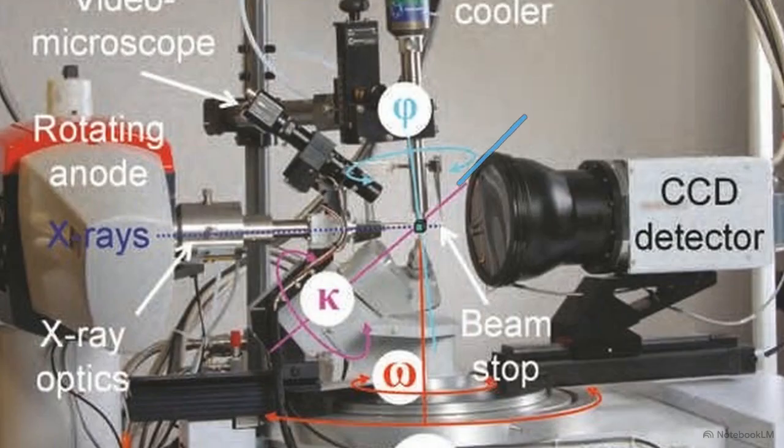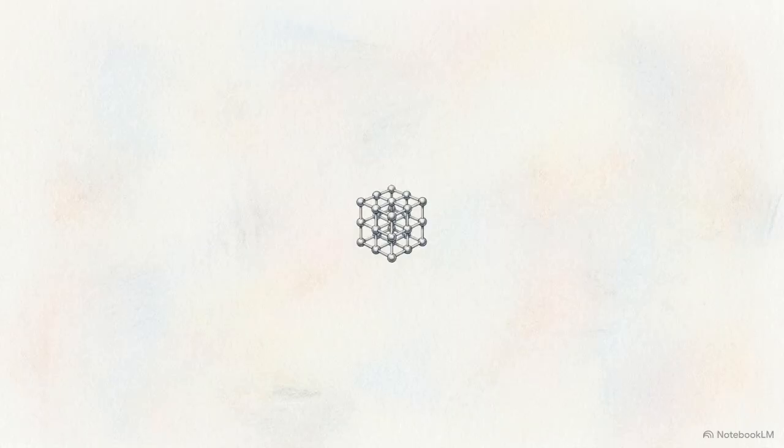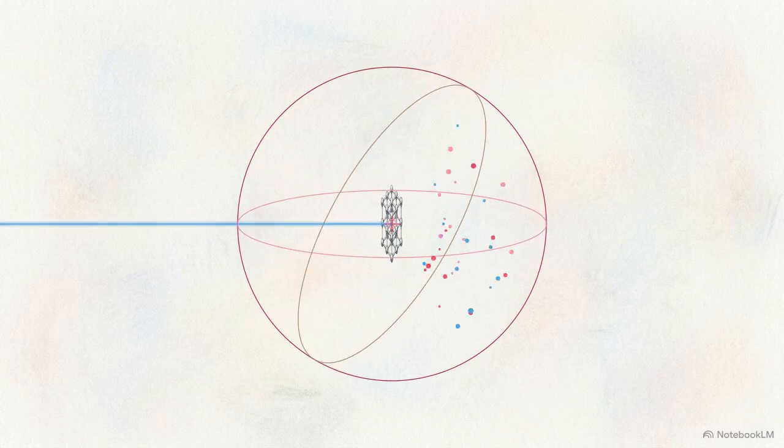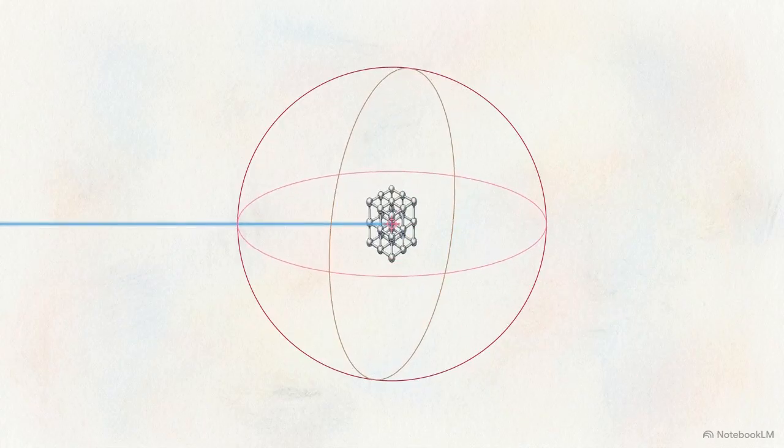Looking closely at the central goniostat, we find the eucentric point. This is the precise microscopic intersection where the omega, phi, and kappa axes meet the incoming X-ray beam. The biological crystal must be systematically rotated through this precise intersection to capture reflection data across the entire solid angle.